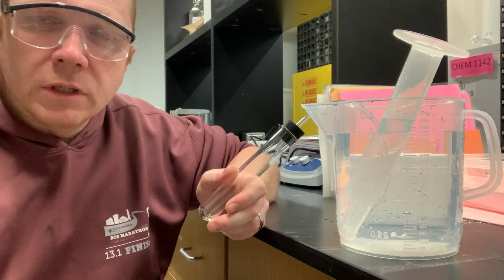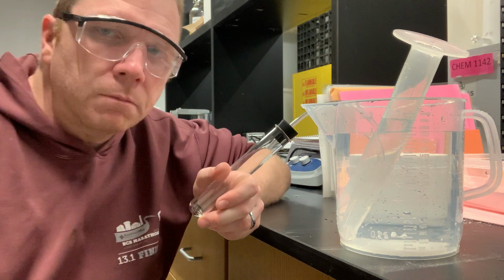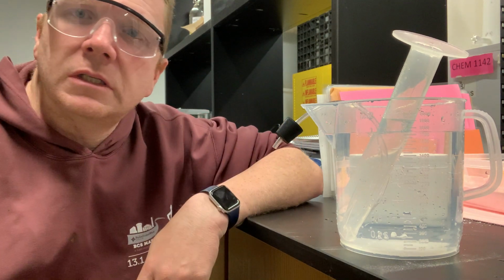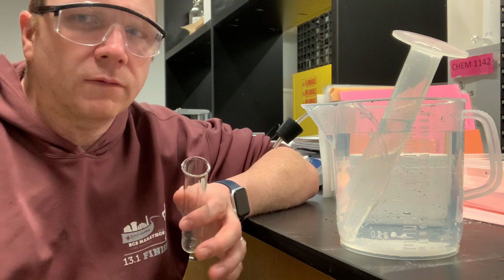Now, what I always want to be certain of is to review my grad cylinder's gas volume to make sure that it hasn't changed at all. As you can see, my hand did get wet, but this is deionized water. I'm not introducing any sort of acid in there or anything like that, so I don't have to worry too much.